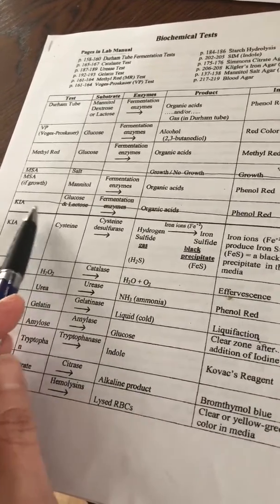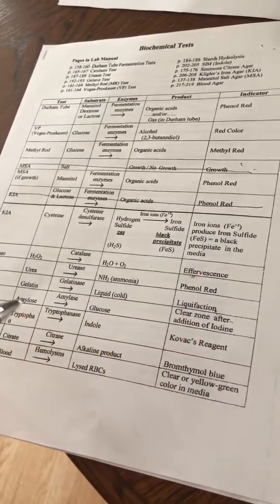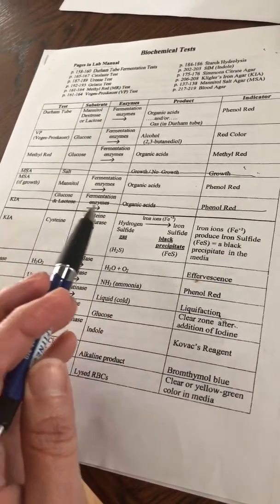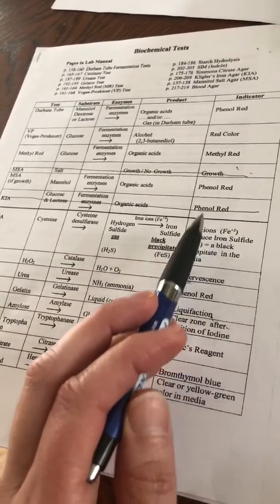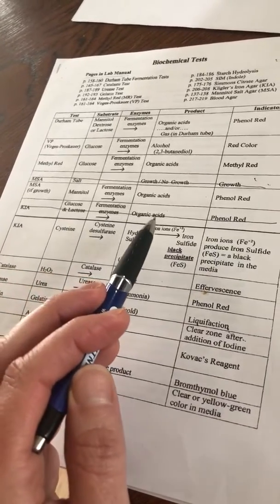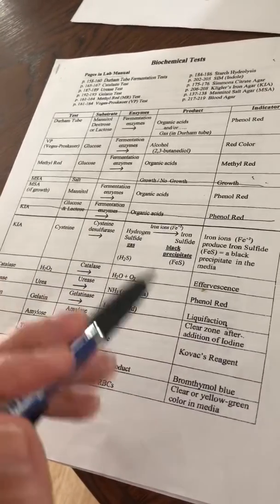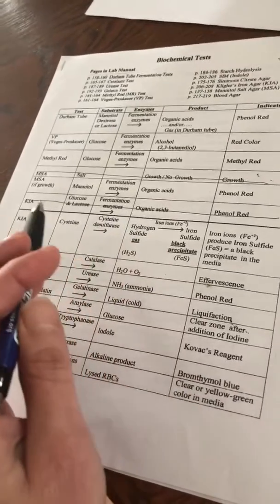This first line of KIA, glucose and lactose, fermentation enzymes, organic acids, you can cross that out. I didn't talk about that in that segment because we didn't see it in the test tubes that I grew. Some of your bacteria would have grown and changed the media a couple of different colors because there's phenol red in that media as well as those iron ions. And if your bacteria could ferment the glucose or the lactose, it would have created organic acids and turned your test tubes yellow or half yellow and half magenta or all magenta, depending on whether it could ferment those sugars or not. But we didn't see that in the 2 test tubes that I grew.